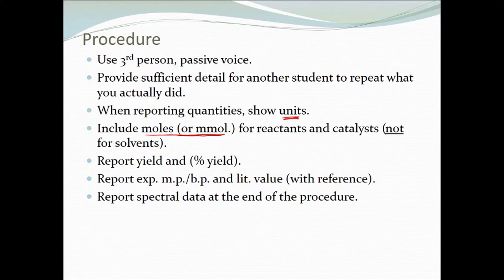You would need to give the concentration. Since it is a solution, you would need to state that it was concentrated or 18 molar and also report the moles. Of course, you always report yield and percent yield, and if you measure it, you would report melting point or boiling point. In this case, you should have a boiling point, and you will, in parentheses immediately after that, simply put literature and then give the literature boiling point that you're comparing it to.